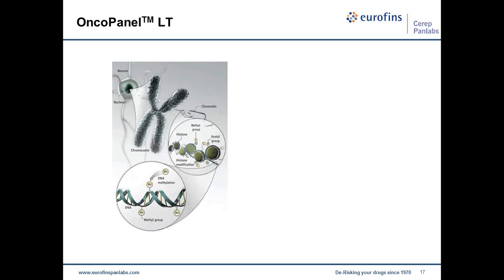So to try to address this issue, we set out to develop a method that would allow cancer cell line profiling with incubations as long as 10 days. This is to identify both sensitive and resistant cell lines and cancer types, as well as to identify the genomic biomarkers that predict drug response.